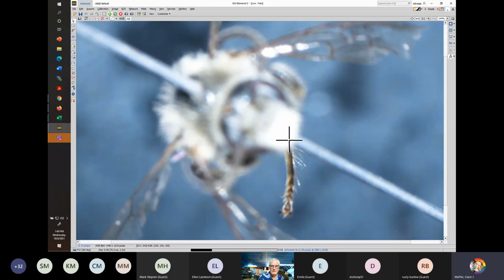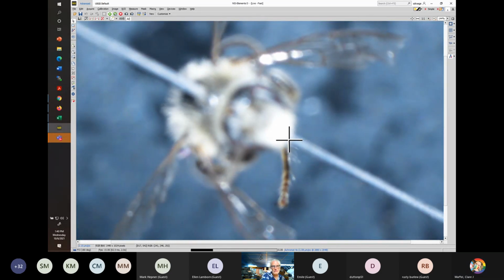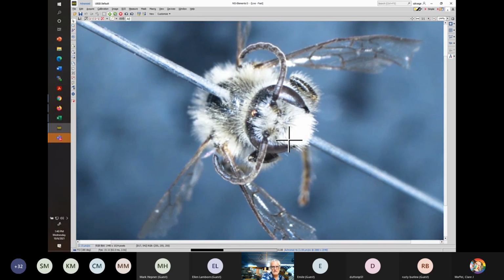What species are we still at? Melittoides, or what's the species? This is Melitta melittoides male. Gotcha. The males don't have really special features. When you see that, it's a very generic looking bee. You could look at this, I think, and quickly decide that it's an Andrena when it wasn't. So if we wanted to spend more time, we could go through the Discover Life guide for the males.